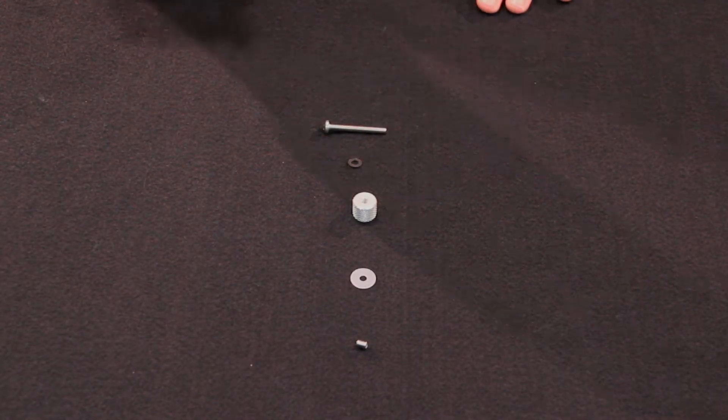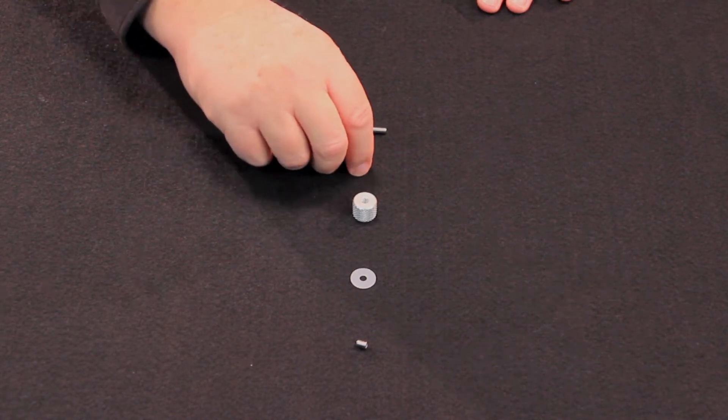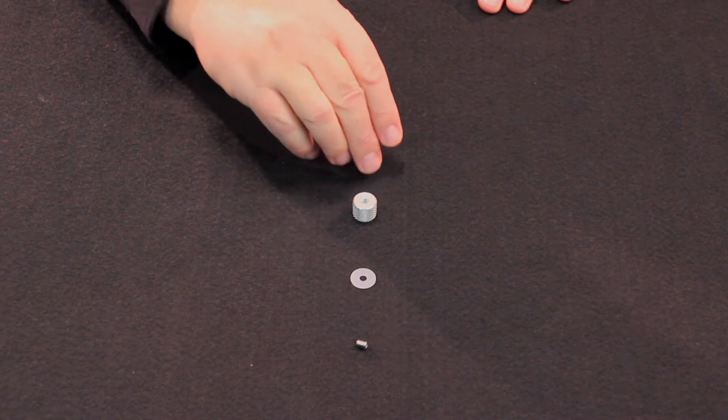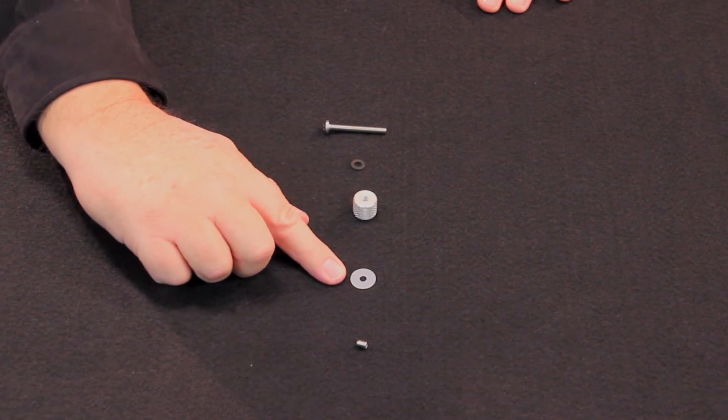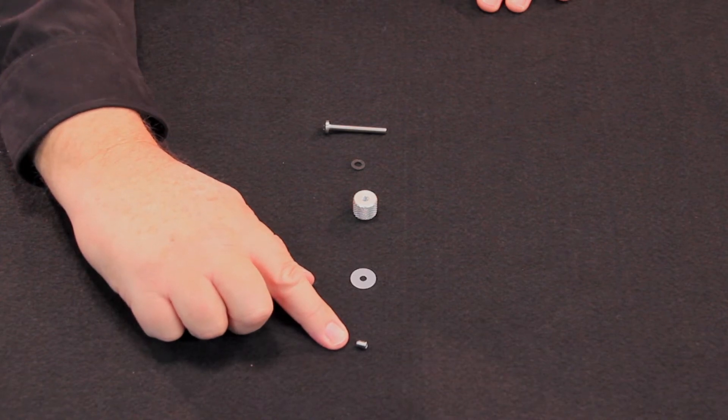The parts involved with the flow adjust knob are a 1 and 5/8 inch 10-32 thread Phillips head screw, a number 10 3/8 inch flat washer, the knurled flow adjust knob, a white plastic flat washer, and the 1/4 inch 10-32 thread set screw.